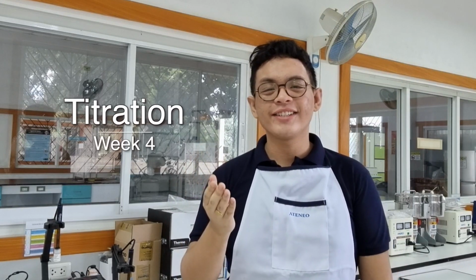You already know that gravimetry is the chemical analysis where we measure mass for use in chemical calculations. But what if instead of mass, we measured volume instead? That is the gist of titration or titrimetry. In this video, I'll show you how I can do just that in the laboratory. I will be measuring volume so that I could calculate the concentration of the analyte in my sample. If you're ready to learn, let's do some experiments.